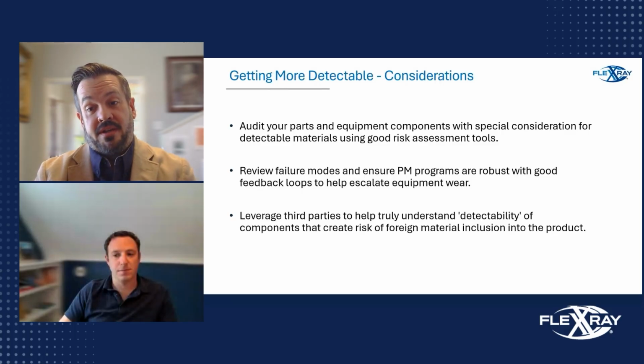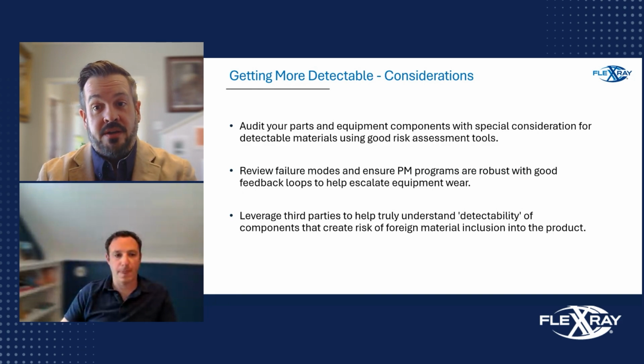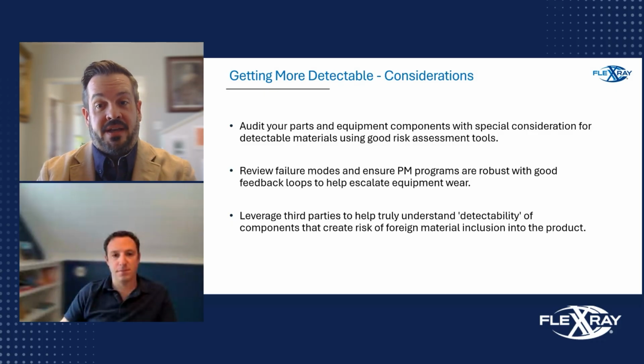They could be something like a paddle inside of a scraper or a blender as well. There's an opportunity for us to evaluate that we're using materials that can be detected, because we're adding detectability at a much more robust level through CT. So now it's really time for us to take advantage of ensuring that we do have detectability within those.